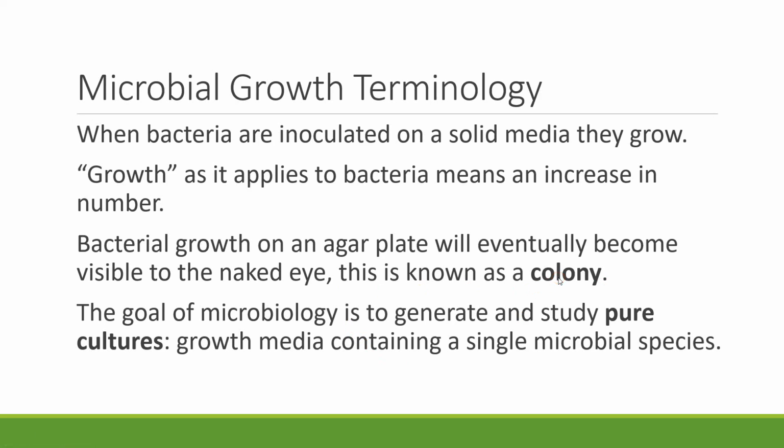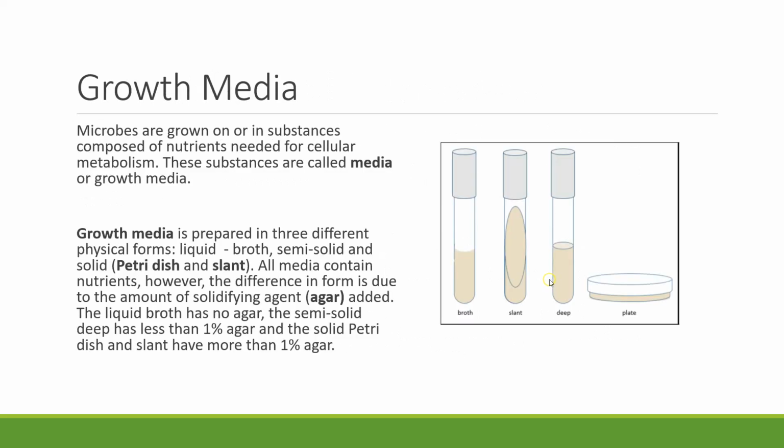Another term that you need to recognize is that when we try to grow microbes in lab, we want to have what we call pure cultures to study them. Why? Because then that means there's only one species, a single species of microbe on each of those cultures. And so that's what we want to maintain, is pure cultures in our microbiology lab. And therefore we need to know proper aseptic techniques in order to maintain those pure cultures.